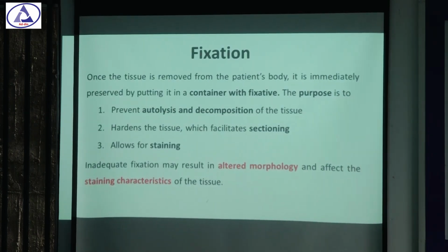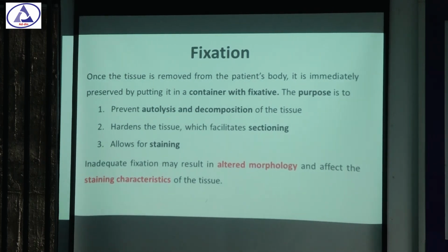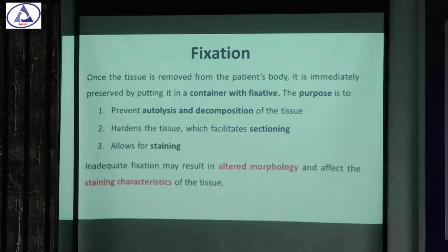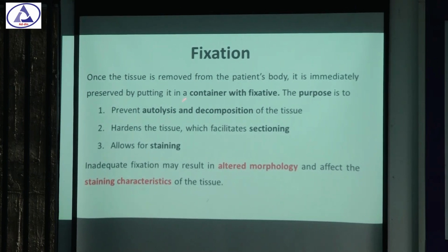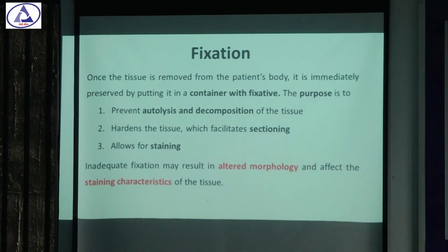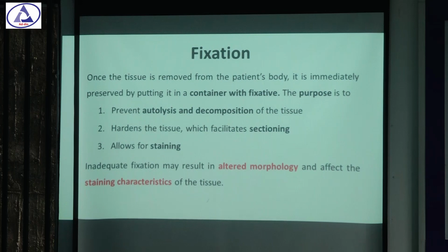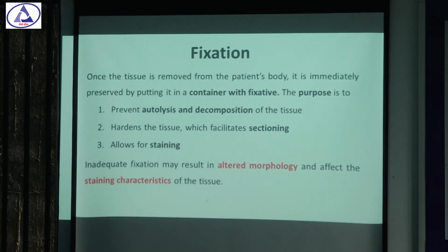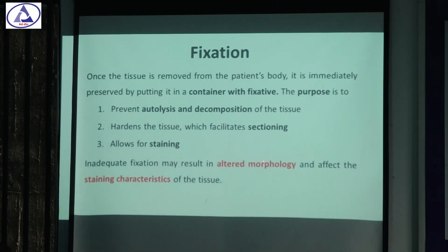So what to do after we have taken a biopsy? The most important part for a physician after taking a biopsy is to put it in a fixative. And if we do not put it in a fixative, what will happen? It will cause autolysis and decomposition of the tissue. So what is a fixative? It is a chemical substance which prevents autolysis of the tissues. So by fixative, we can allow the tissue to be sectioned and stained. And inadequate fixation results in altered morphology.